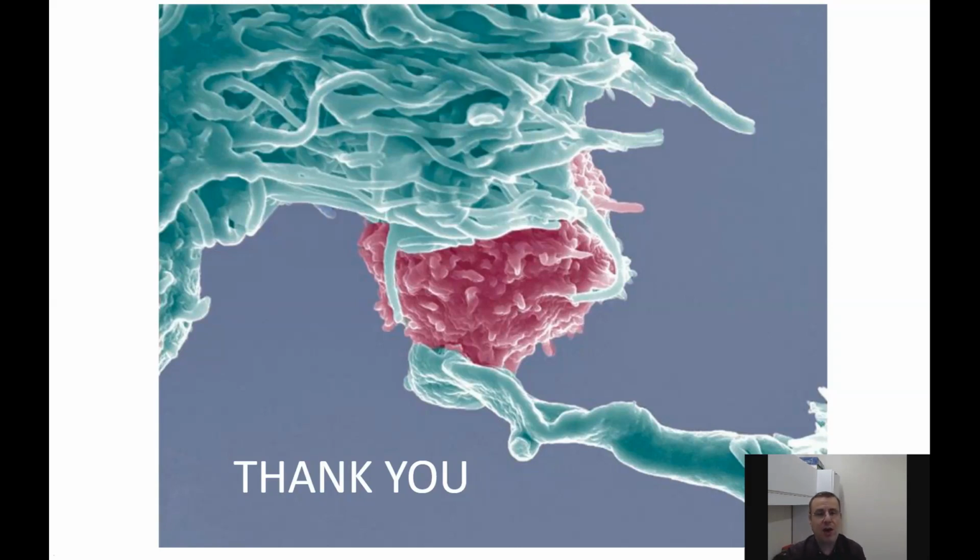The usefulness of multiplex proteomics is in the initial phase, the investigation, the discovery phase. But ultimately, you cannot analyze thousands of proteins and use this as a fingerprint alone of how patients are going to react and respond to treatment. I think a handful of proteins in a limited panel is probably what we're striving for going forward. But without the multiplex proteomics in the initial phase, there could be proteins out there that are potentially useful, and they can go undetected.